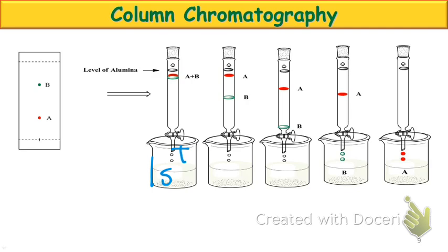You took TLC. What did you do with TLC? You spotted your compounds on it. That's exactly what we just did now. Then what did you do? You just kind of held it up in the air, turned it upside down, shook it a whole bunch? What capillary action? You had to take your TLC plate and put it in some solvent, so the solvent could rise up through it. How are we going to get our compounds to move down the column? You need to have solvent pushing along behind it. So once your compound's loaded onto your column, you can add solvent to the top. That is now going to push your compounds through the column. Okay? And it will push them according to their strength of interaction with the silica.